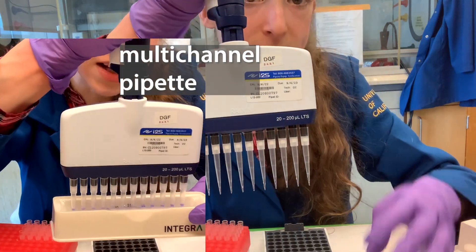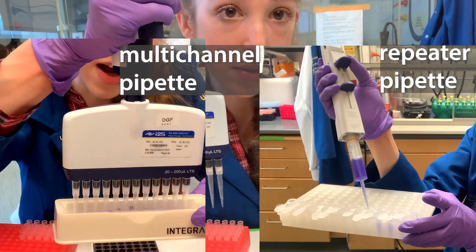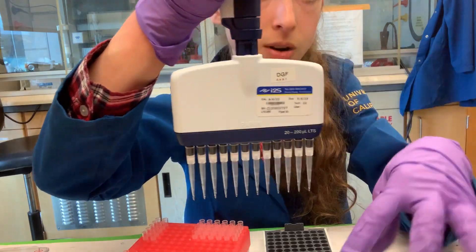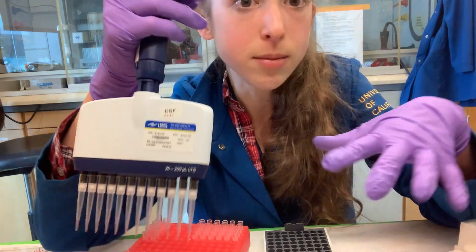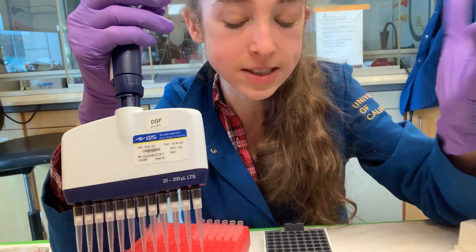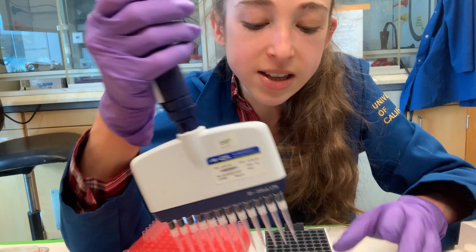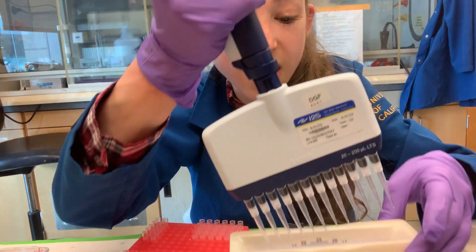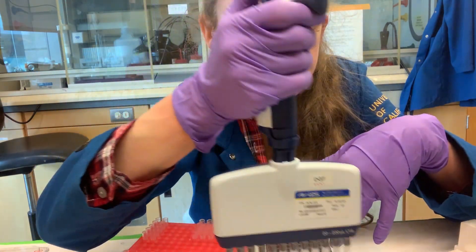With a multi-channel pipette, these can be different liquids if you're setting things up in tubes, or they can be the same liquid if you have it in a reagent reservoir and you're dispensing into corresponding tubes, plates, or whatever you need. It can be really helpful when setting up assays or experiments with a lot of samples. There are some nuances and caveats you have to be careful about — making sure all the levels are even, not working at an angle. Let's get into those details.